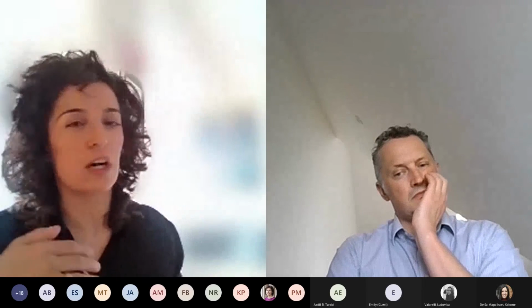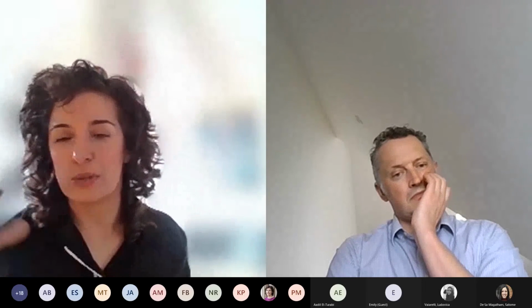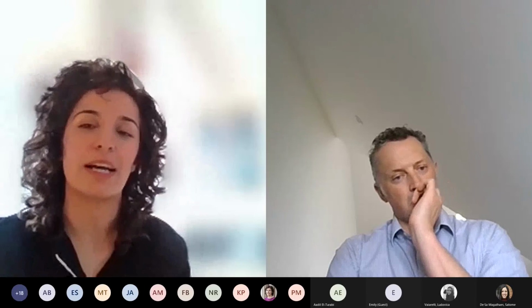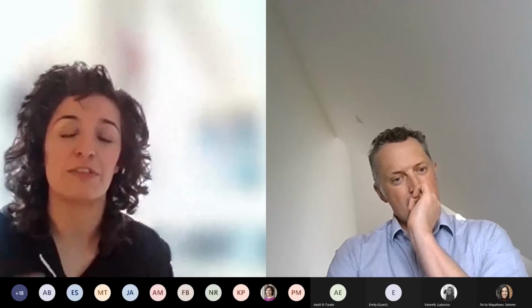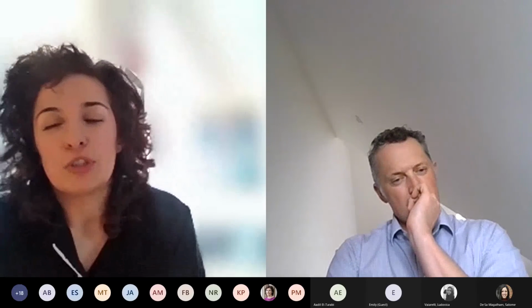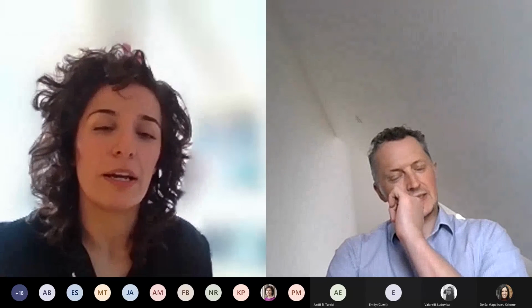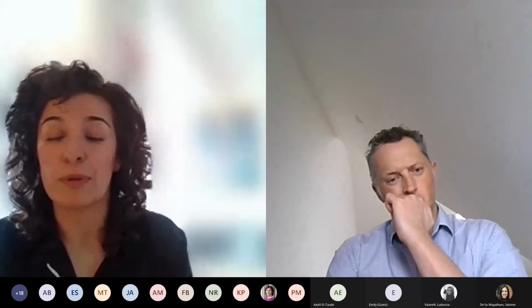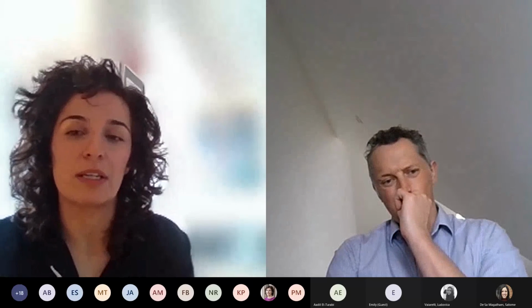It's definitely not 100% accurate all of the time. And that's one of the downsides, I think, with working with things like exosomes and VLPs and so on. Unless you label them, you are restricted to their size and shape. The good thing, as a bit of a bonus, is that NanoW is a stain that works really well with gold nano labeling.